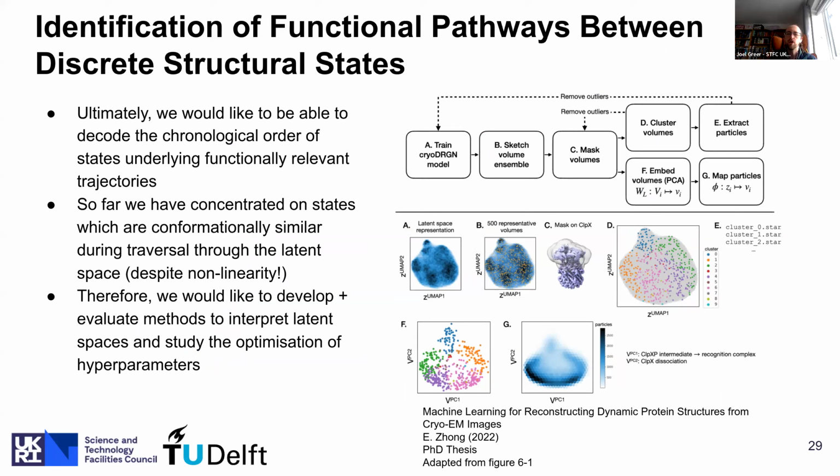So in our work so far, we've concentrated on understanding whether the continuous heterogeneity present in our MD datasets can be visually interpreted in embeddings of the learned latent representation, and whether the decoded volume representations are more similar to atomic models from the MD simulation frames, which we would expect them to be most similar to, i.e. those which are close in time.